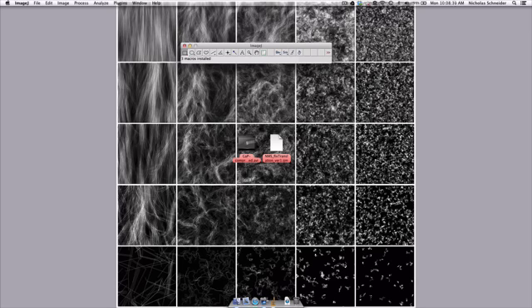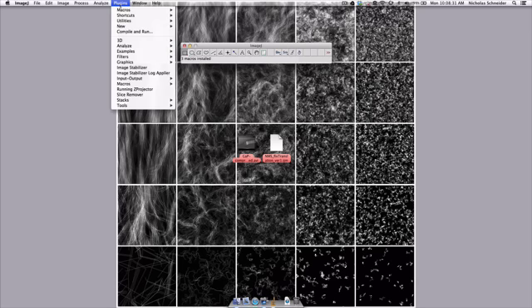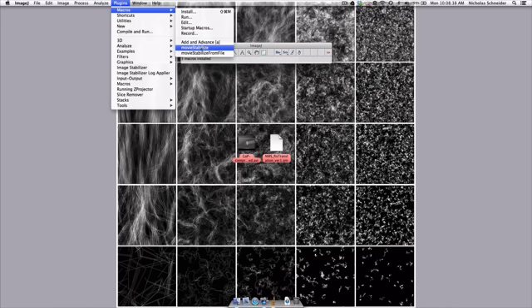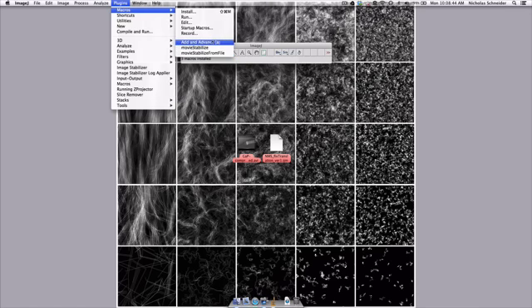And we can see these by going back to Plugins, Macros, and seeing that we have the first one which is called Add and Advance with a shortcut key of A on the keyboard, next we have Movie Stabilize, and then Movie Stabilize from File. So we'll see what each of these does.